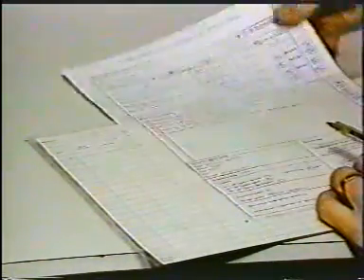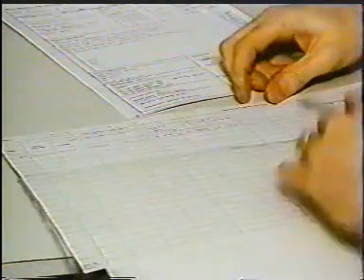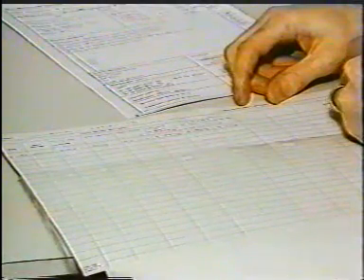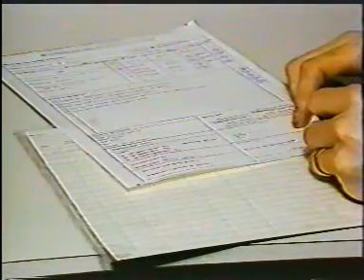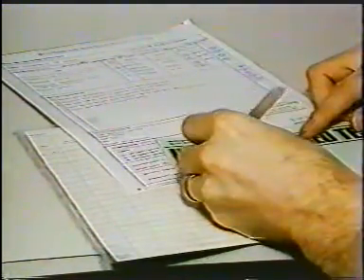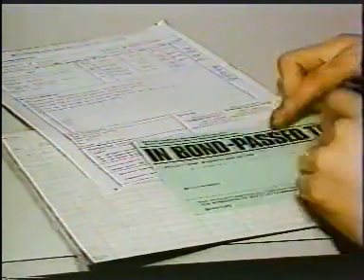Once all the necessary tests have been carried out on a batch of finished product, a decision can be made as to whether it can be released for use. The quality control pharmacist reviews not only the testing results, but also the batch sheet and any other documentary evidence such as temperature record charts. If the product is satisfactory, the batch sheet is signed and dated, and release is effected by a member of the quality control staff. No batch, part batch, or container may be removed from bond without the authorization of a quality control pharmacist.